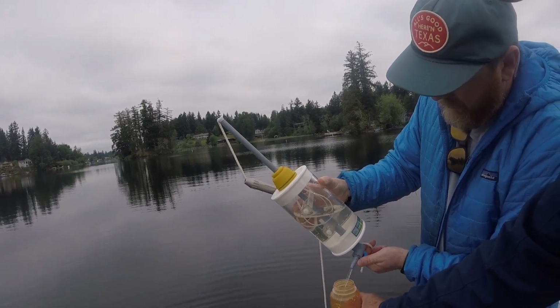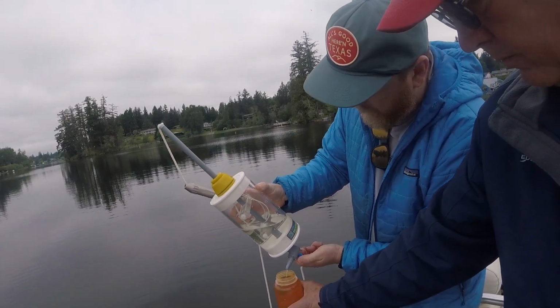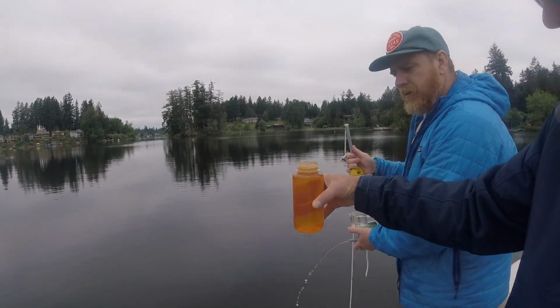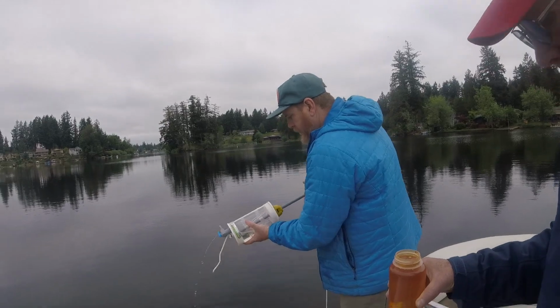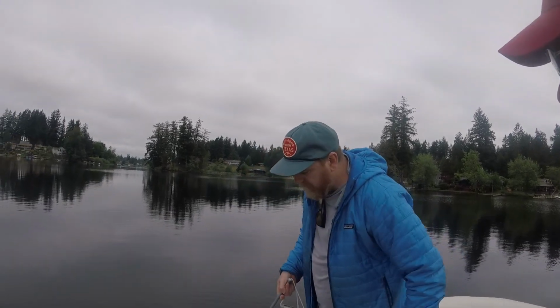So how much iodine do you put in a bottle this size? It's like 2% to 5%, and I think I was putting about 2 to 3. This looks like about a 12-ounce bottle. Yeah, I believe so. It's a 250 milliliter bottle, and I put about 2 to 3 milliliters of iodine in there.